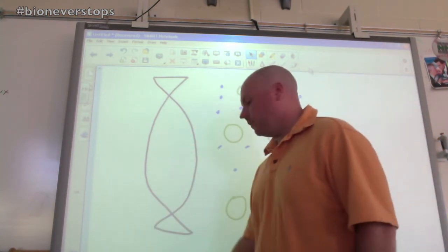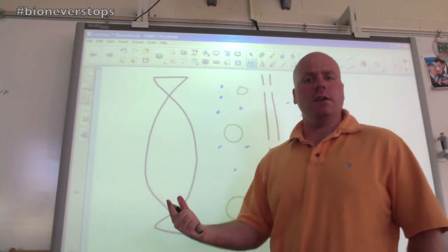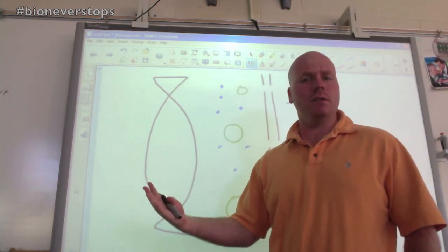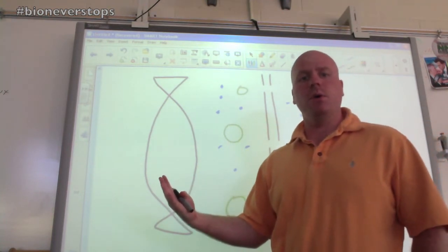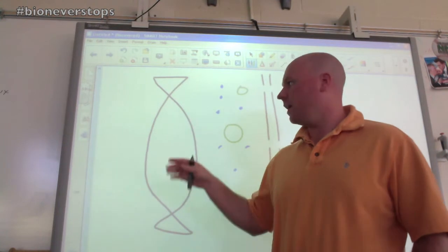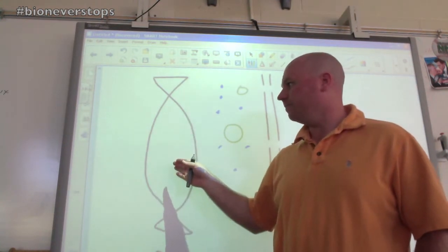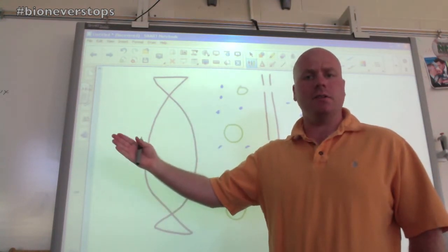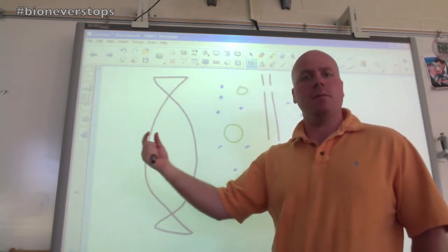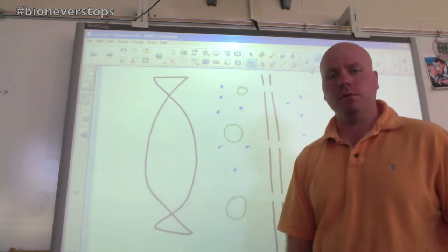You're going to have a series of solutions. There's going to be salt water, sucrose water, glucose water. I'm going to have some egg whites also that you could use to put in there. And you're going to soak them in any of those solutions too. All right, so you're going to have a solution inside the bag and another solution outside of the bag. And you're going to see which way water is going to move through that membrane, or if you think things other than water are moving through that membrane.